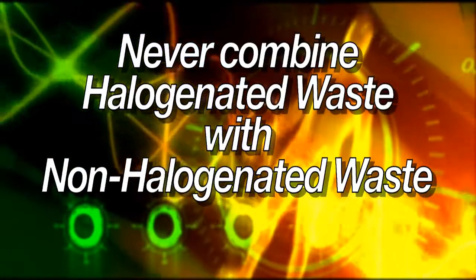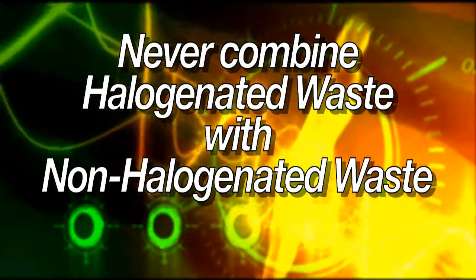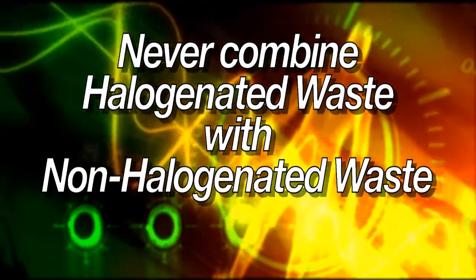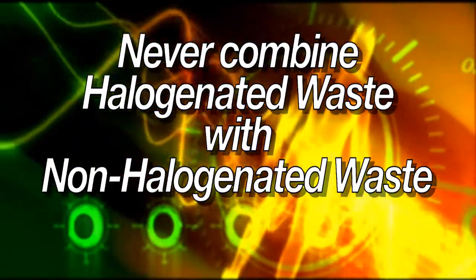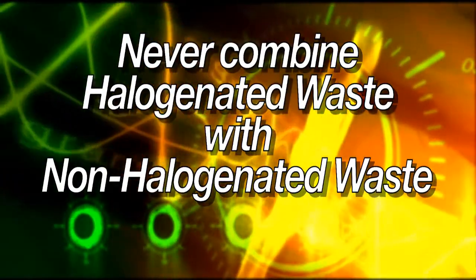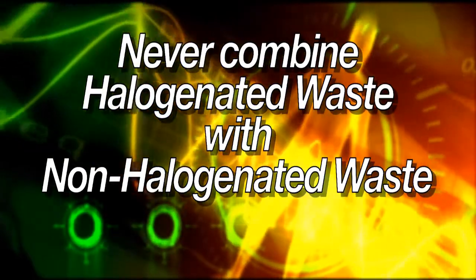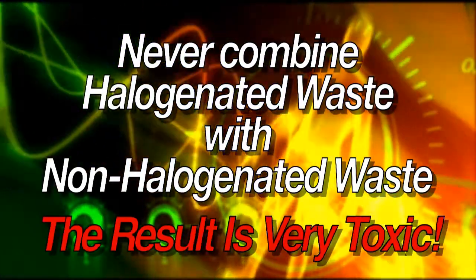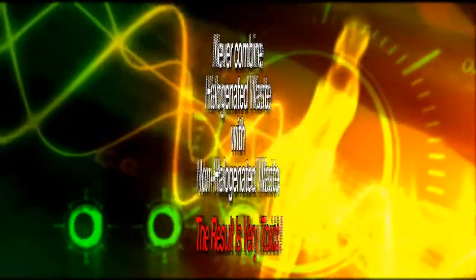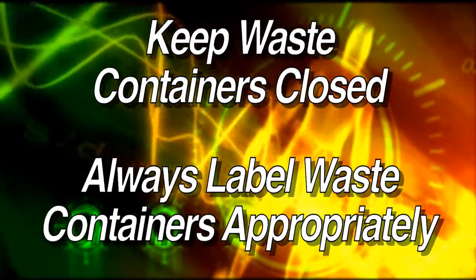There are two types of chemical waste that should never be combined. Halogenated organic waste has one or more carbon atoms that are covalently bonded to one or more halogen atoms such as fluorine, chlorine, bromine, and iodine. Non-halogenated organic waste has one or more carbon atoms bonded to a non-halogen atom. Combining these two types of waste creates a very toxic compound that is difficult to remediate. Waste bottles must be closed and labeled with the word waste and contents of the bottle.